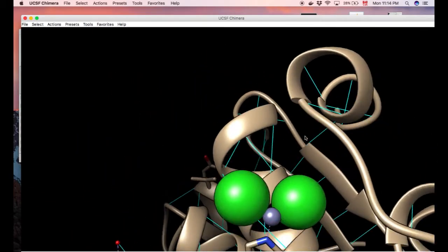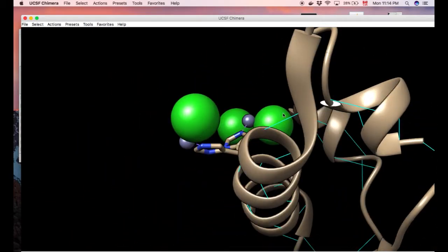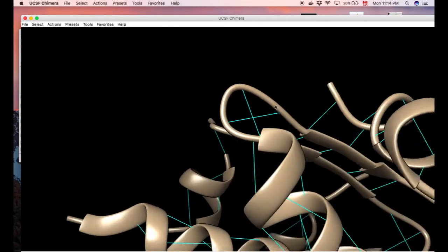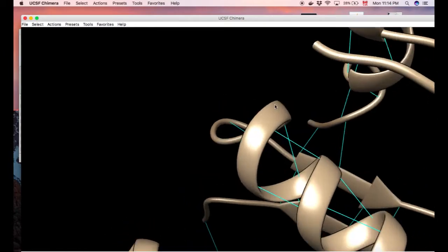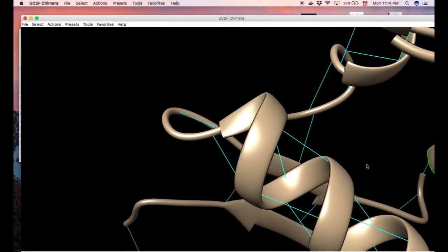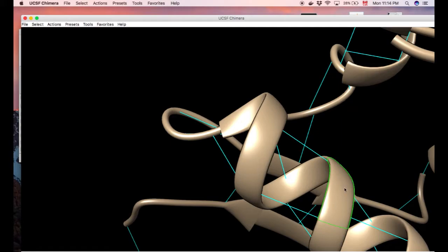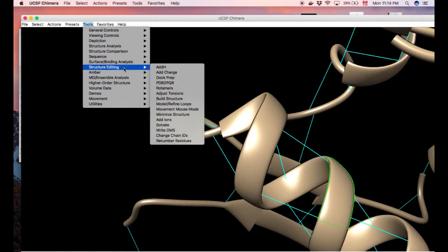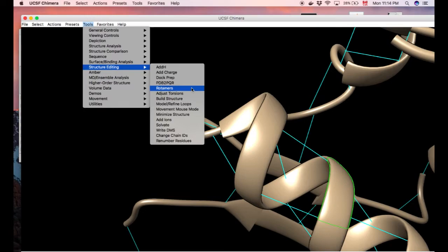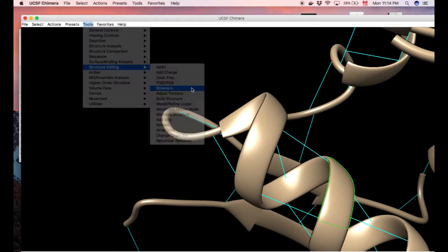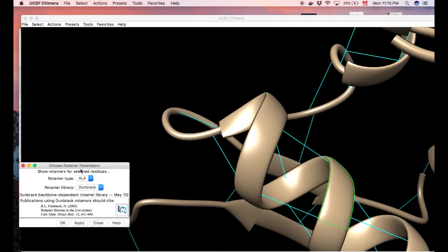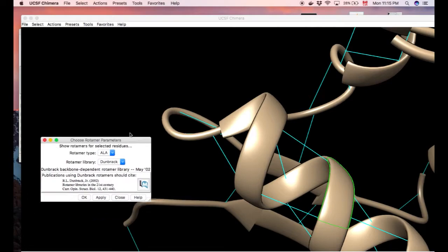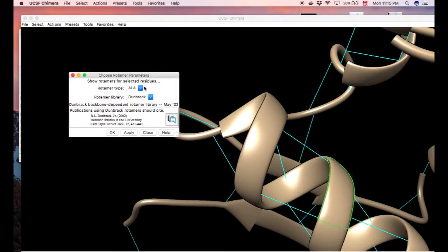Now, let's say you're in the lab and you're very interested in a mutation. So let's say you're looking insulin and maybe position alanine 14 is transformed into a tryptophan. So really big, bulky element. How would you check that? Well, you could check for clash and contacts, but first you need to mutate it. So there's no tool in UCSF Chimera that's called mutagenesis or mutation. It's actually called Rotamer. Rotamer does the exact same thing, it's just named differently.